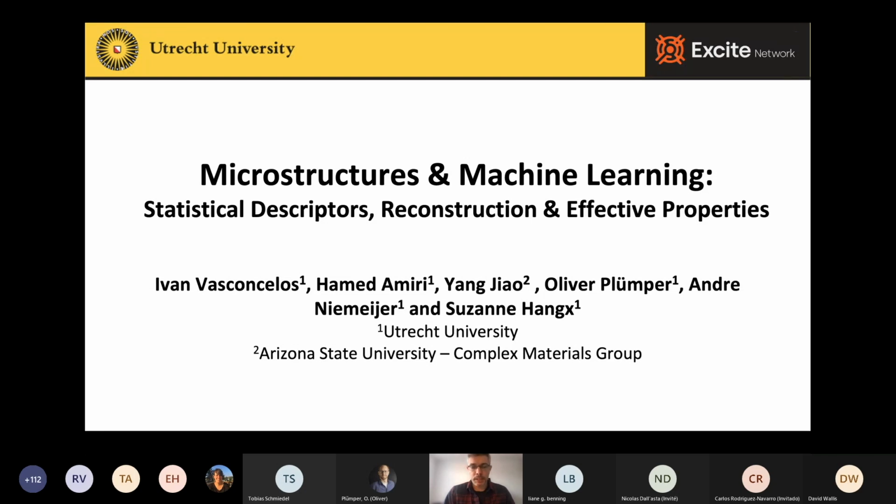I'm just here to show examples of problems where now we can have better solutions because of what machine learning has to offer. The other thing that we'll look at here is that, of course, machine learning has been used for many things when it comes to microstructures. For example, segmentation is a very difficult task, and it's often now achieved very reliably by machine learning. So we're not going to talk about some of those applications. We're going to talk about actually two specific applications of machine learning. I will also introduce to you a concept as to how to think of materials in a way that you may not be familiar with.